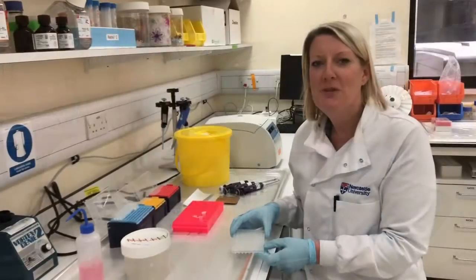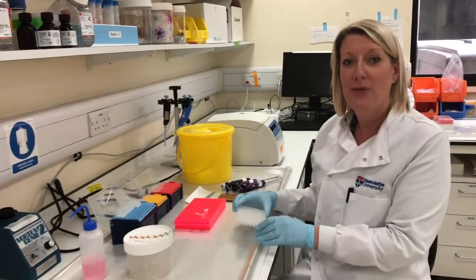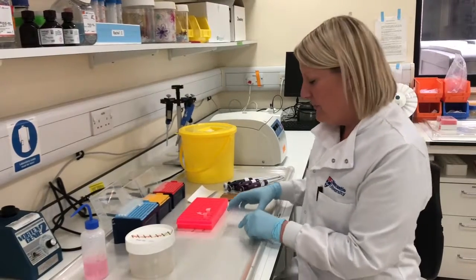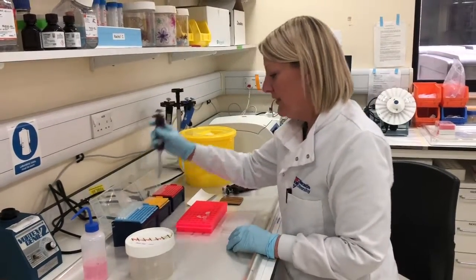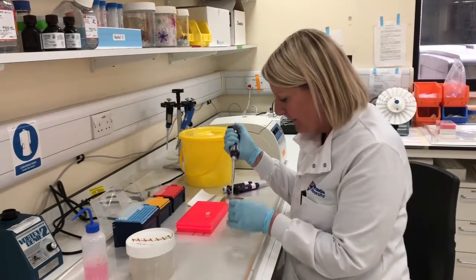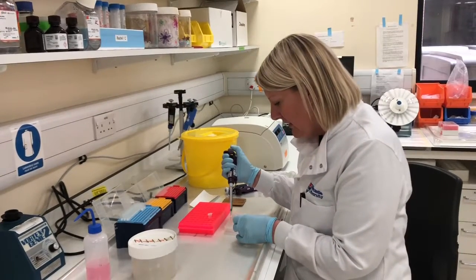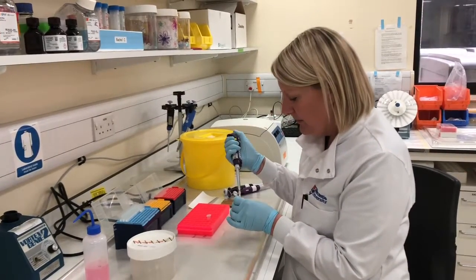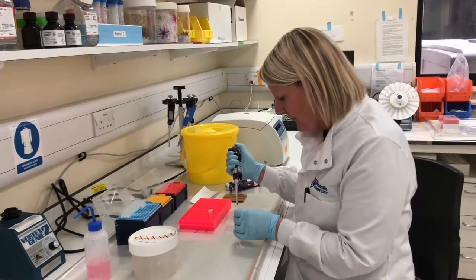So the real-time PCR machine reads the samples in this 96-well plate, so we need to set up the plate before we carry out the reaction in the machine. So what we need to do is we add our patient DNA samples and our normal healthy control DNA samples to the plate first, as it's the DNA from the patient cells that have the genes in them that we're looking at to see what the different gene expression is.